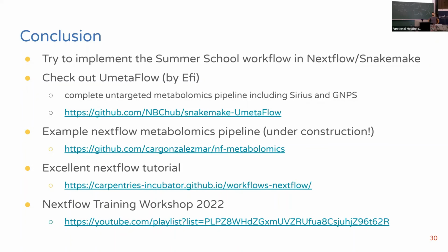Like you have something that you want to do downstream, like annotation in Sirius and feature-based molecular networking, it's always going to look the same, adjusted to your instrument and so on. So if you sit down and take your time to make something for the same machine, it's worth your while. And that's the cool thing. You could make it for your machine and then automatically run a pipeline that analyzes it on the fly once the data is generated.